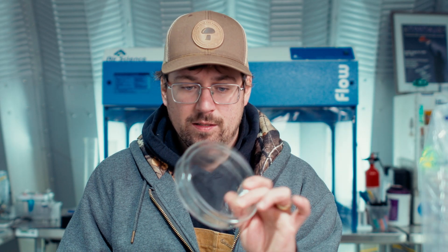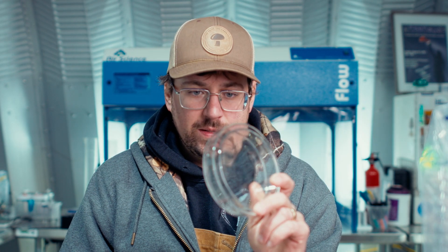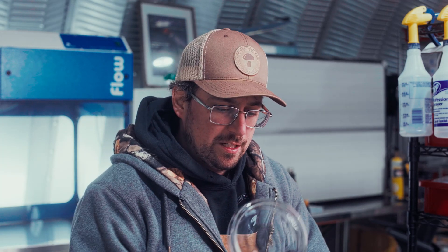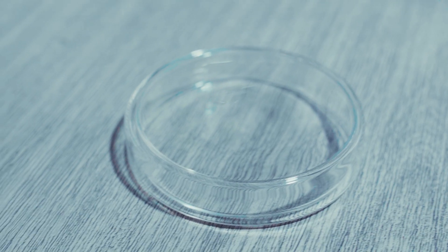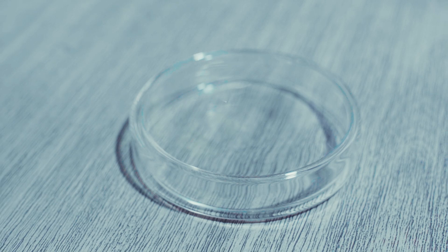The number one pro of glass dishes is that they're reusable. You just have to make a one-time investment and you can re-sterilize and clean them out almost indefinitely, as long as you take care of them. There are really high-quality Pyrex dishes that are even more long-lasting, but in my experience, as long as you don't drop them, they're pretty durable and will last for a very long time.